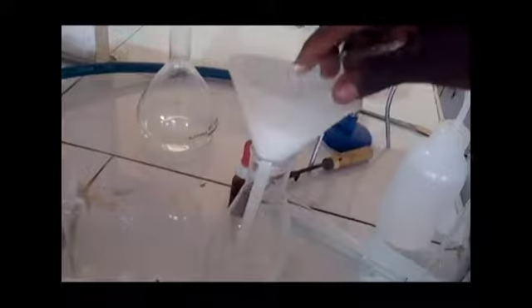Otherwise, we may be asked to filter the solution. Now, how can we filter this solution? We will make use of our filter paper. We will fold it and insert it into a funnel. Now the liquid that pours into the conical flask is known as the filtrate, and the part that remains unfiltered is known as the residue. Our inference test may be carried out on the residue or on the filtrate.